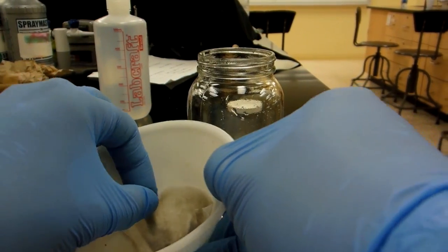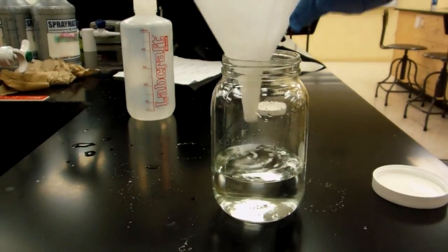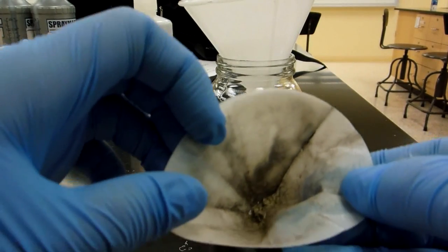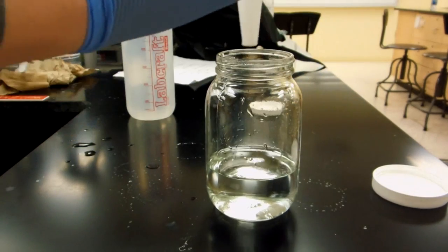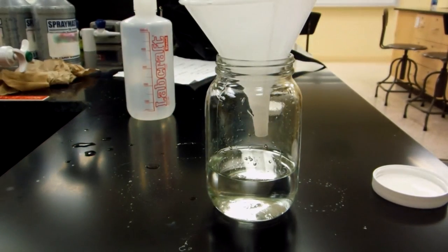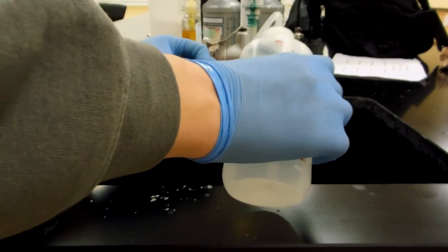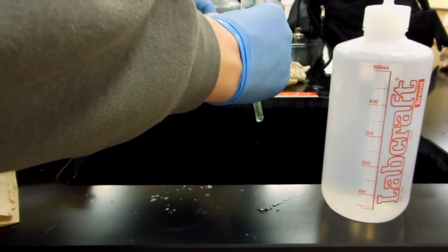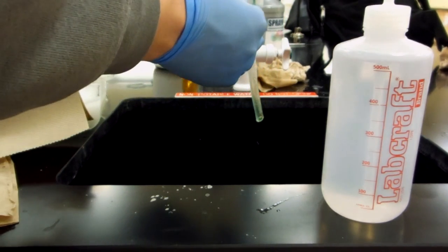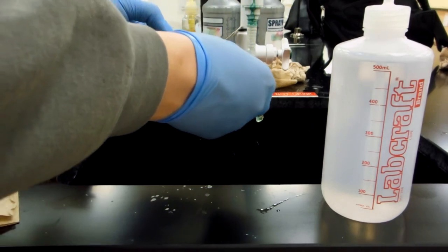So after filtering, I remove the funnel with the filter paper, and I pull out the filter paper and funnel, returning the funnel to the jar. So I fold up the filter paper, and add some deionized water to help rinse out the filter paper, since I've rinsed so many times already that there shouldn't be much in there. And so I just rinse one more time over the sink. And once that's done, I've pretty much completed the process of getting elemental silver.